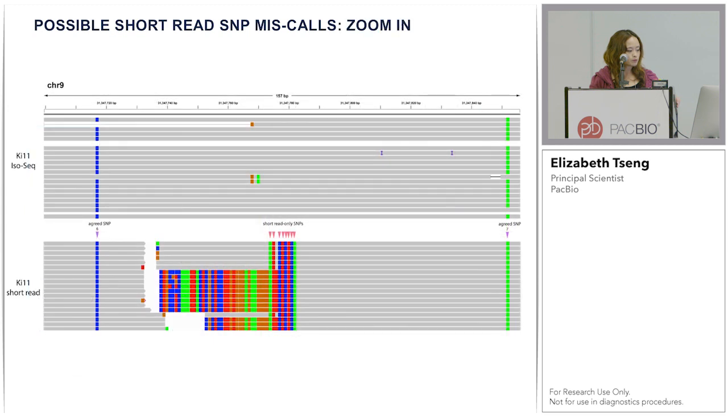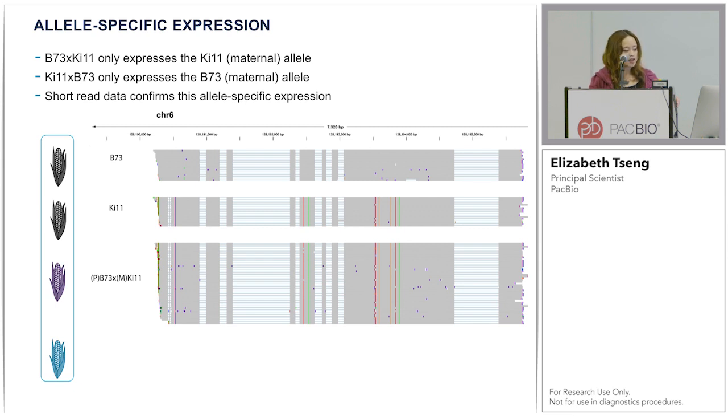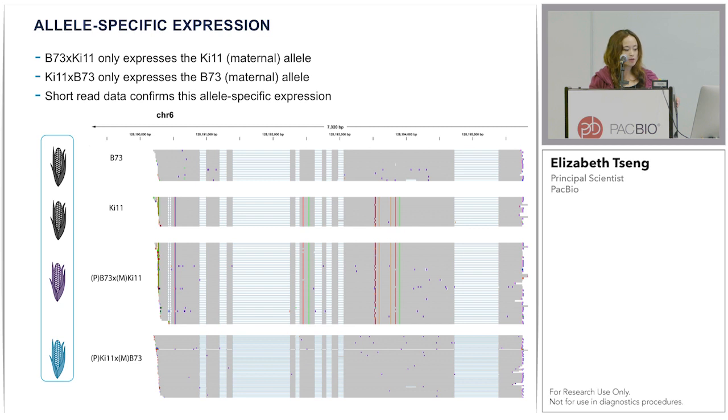Zooming into this region: the upper panel shows the KI11 IsoSeq data, which does not show evidence for SNPs. The lower panel for KI11 short reads shows with red arrows where SNPs are called using short read only. There is some indication this is likely a mismapped set of short reads. I also want to show examples of allele-specific expression. In B73 and KI11, KI11 has the SNPs. In one F1 hybrid, only the KI11, the maternal allele, is expressed. In the other F1 hybrid, the maternal B73 allele is expressed. Short read data not shown here confirms this allele-specific expression.